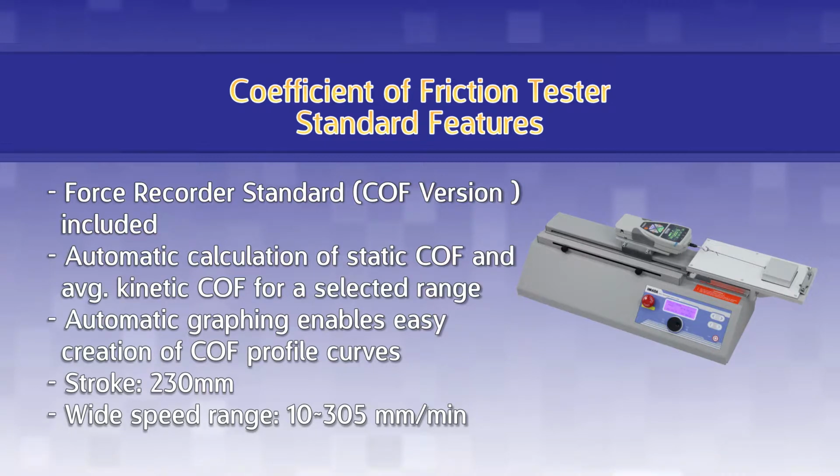The COF Tester features a stroke of 230 mm. The tester also features a wide speed range from 10 to 305 mm per minute.